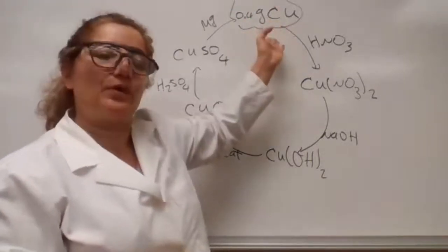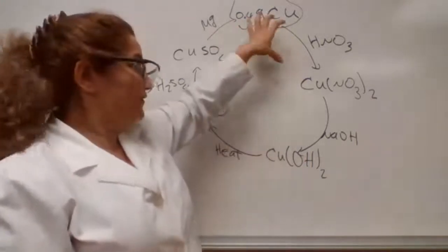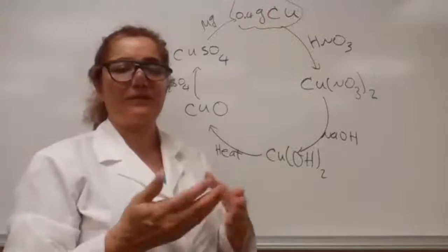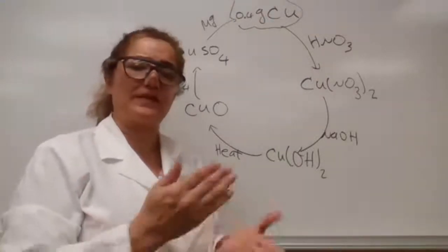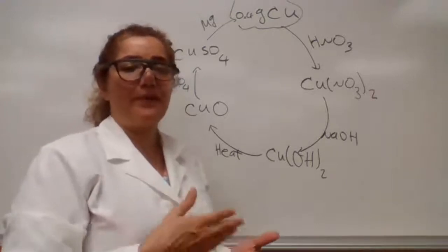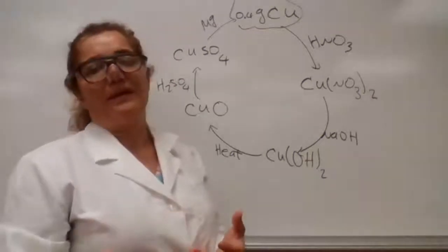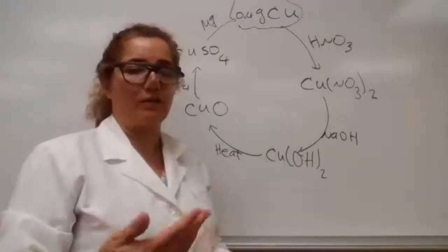Now, are we going to get 0.4 gram of copper? Maybe not. Why not? At the end of the experiment, if the filter paper that we are using to dry up the copper is wet, or if your copper is still wet, it is going to weigh more than just copper. So it is the copper plus the solvent.